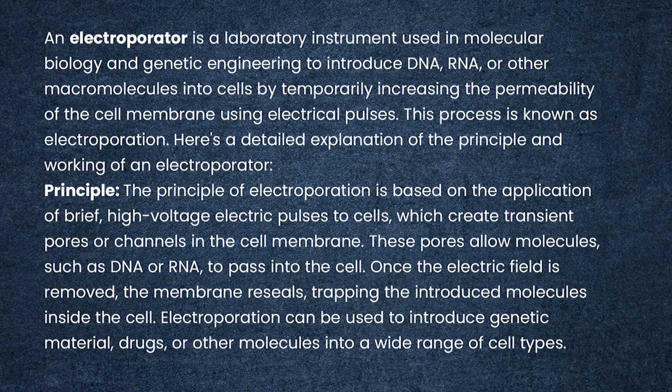These pores allow molecules such as DNA or RNA to pass into the cell. Once the electric field is removed, the membrane reseals, trapping the introduced biomolecules inside the cells. Electroporation can be used to introduce genetic materials, drugs or other molecules into a wide range of cell types.